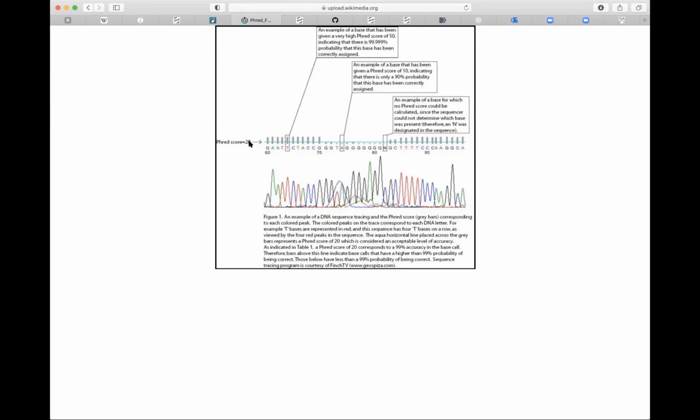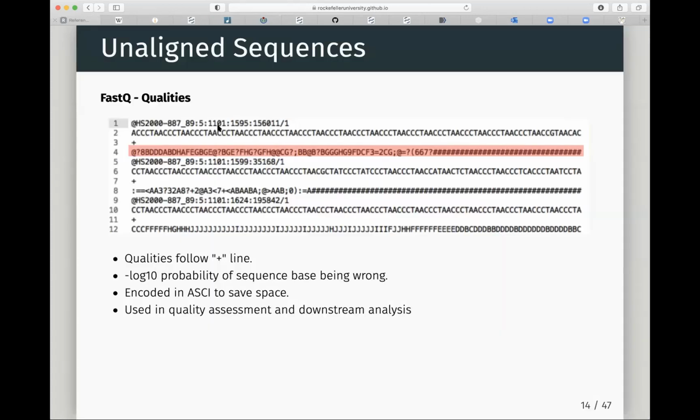And this is what you see reflected in the Phred score. So when the optics reading, the fluorescence coming off the machine, is no longer confident, say I put a C there because I don't see enough blue, or I see blue and green, this is reflected in your Phred score. And this ASCII code here is just the way that we translate a bin, a range of probabilities, into something we can encode. Okay.